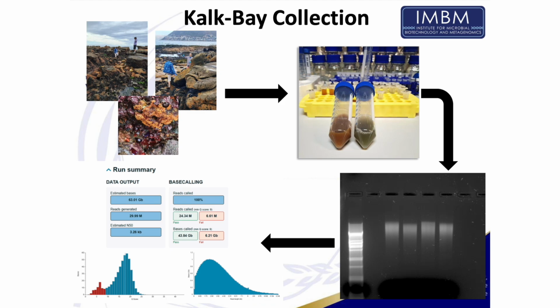Thankfully, the funders gave us some more money to try and get DNA out of this sea sponge that has defied DNA extraction for a year and a half. So yeah, there you can see the brown juice as we always get it. This is what it looks like after I try and filter out all the eukaryotes and things we don't want, to leave us just with the bacterial fraction. So yay! After very long, we have DNA on a gel.